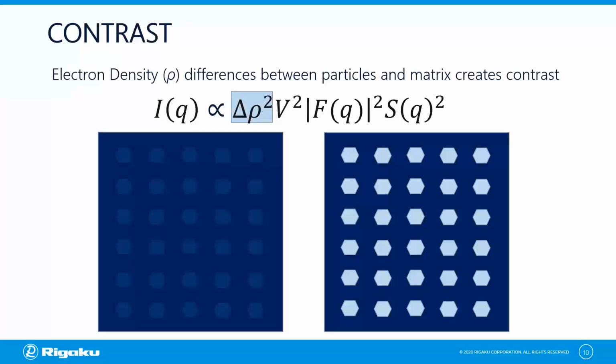So this tells us also that we could manipulate conditions of the buffer that could improve scattering contrast or cause it to deteriorate. The thing to keep in mind is that the solution conditions definitely play a significant role in the scattered intensity we observe.